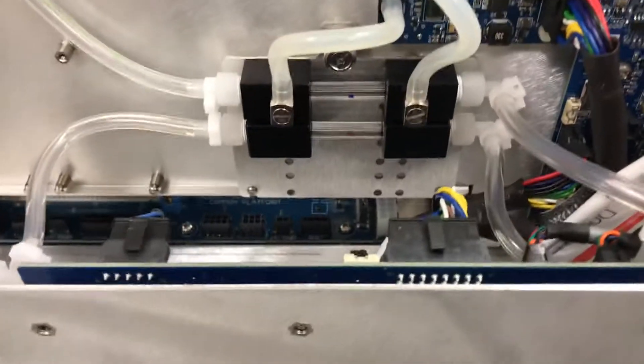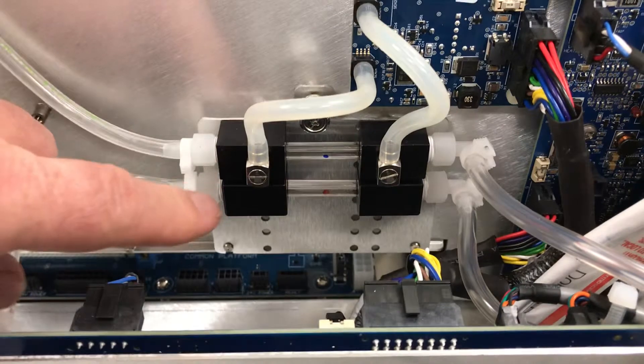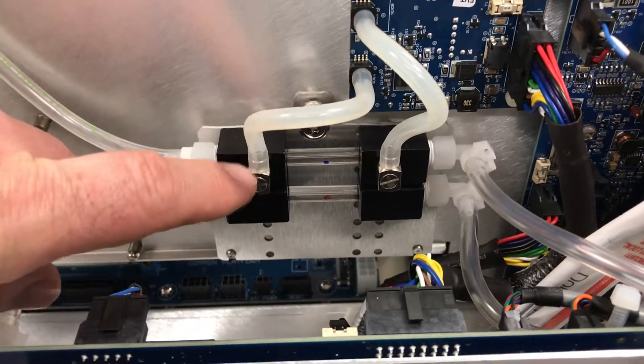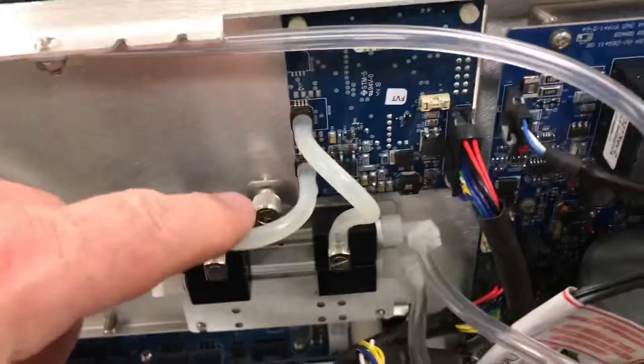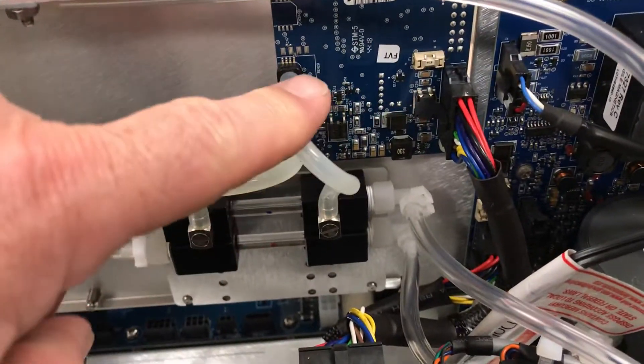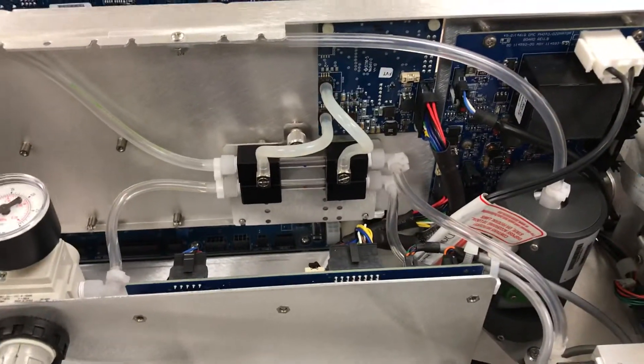For flow and pressure, they've changed the flow sensors and pressure sensors — they've eliminated them and gone with a capillary assembly, with differential pressure being measured across them and flow and pressure coming off of this circuit board here. It's a great improvement over those previous flow and pressure sensors.